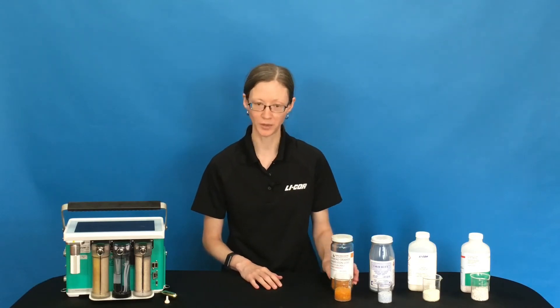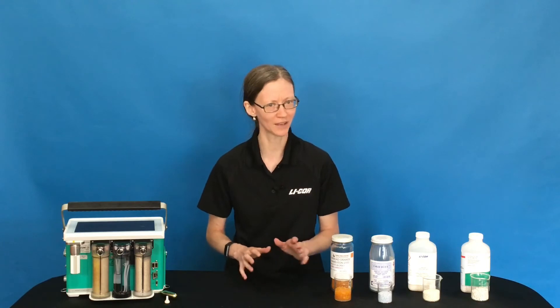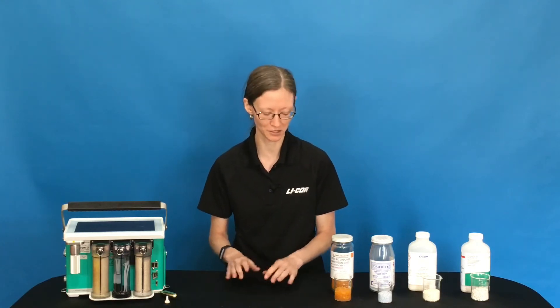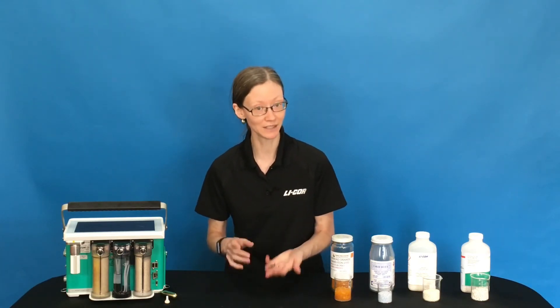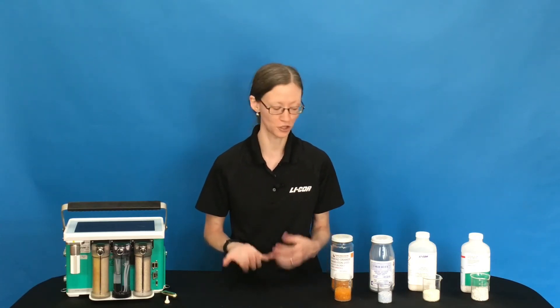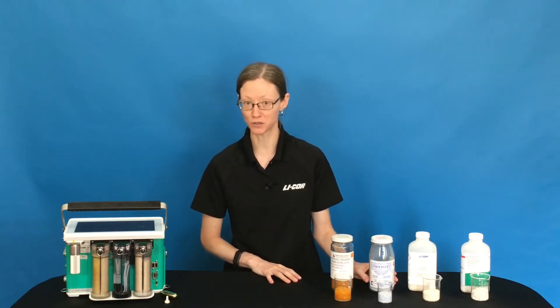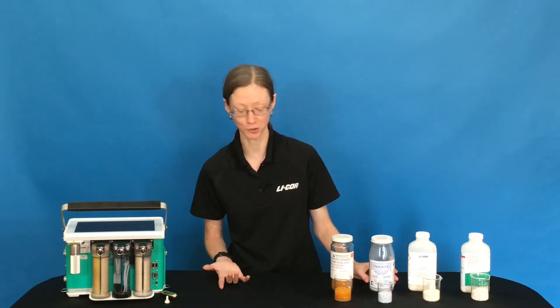There are some real pros to Sorbide, but you shouldn't use it for zeroing your analyzers. It buffers CO2 and H2O a little bit too much for that, so it's not going to be good for zeroing. If you did need to zero, then we would recommend that you consider still using DryRite. You may still have DryRite on your instrument and bottles of DryRite in your lab.